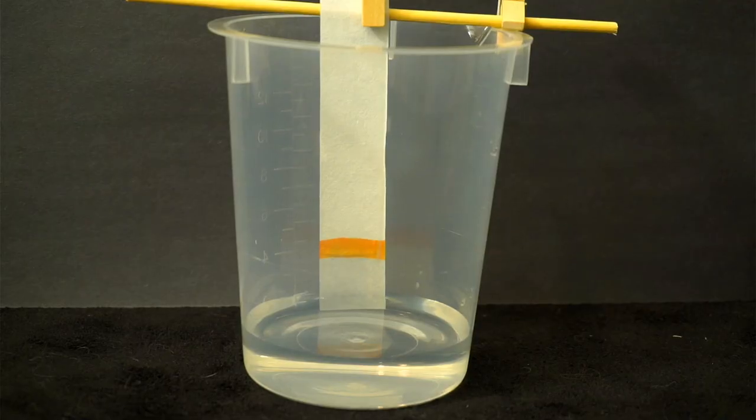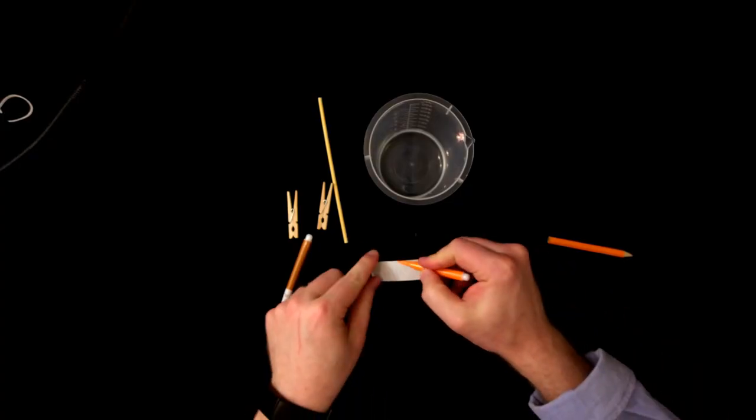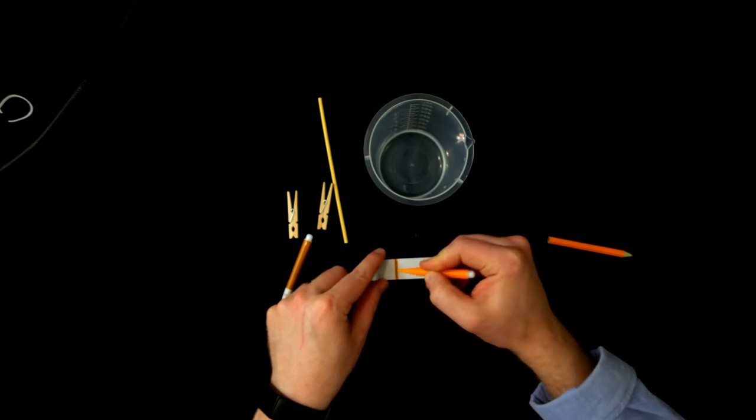So this kind of works. You can see the orange dye traveling up the paper strip, but I only put the one color on there. This demonstration works much better if you overlay two inks. So let's try that again. But this time, we're going to put one line of orange ink down, and then apply a second dye, in this case kind of a purple ink, over the top of it.